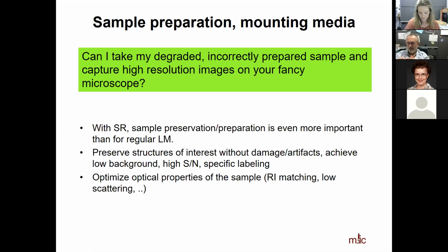Looking at what you presented, Doc, as an embryologist, I just basically use the confocal over at the image analysis lab. But if I wanted to step that up a notch, I prepared everything TUNEL, so I would probably have to go to a different format to get to the next level of imaging.